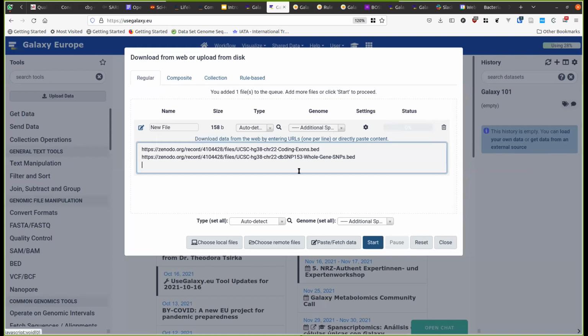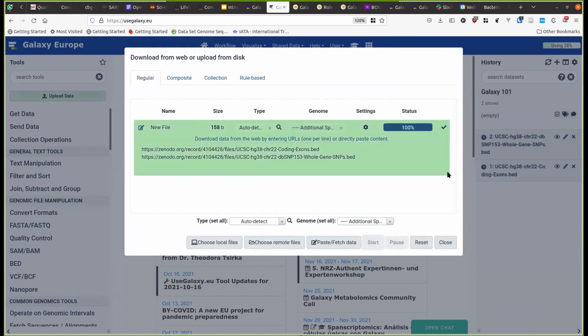Okay, so as before, I'm pasting these links and I'm clicking start. But it has chosen the names from the link.